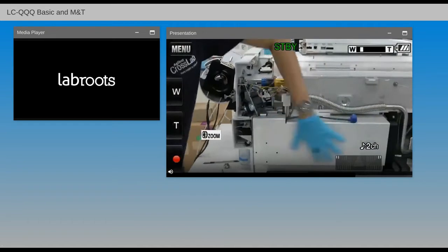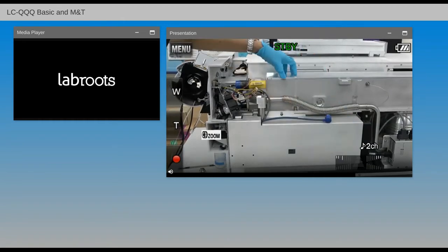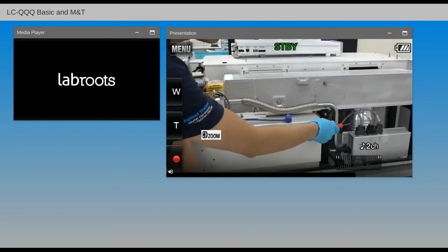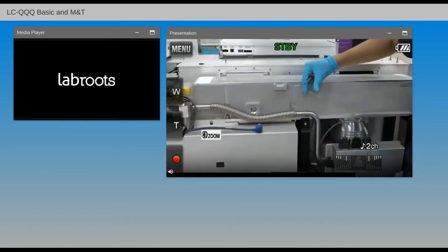What you do not see is of course the turbo pumps that are hidden in there. We do see the back end of the pump, the roughing pump, over here. And I shall go over. There is a brown tubing, and you may be wondering what this brown tubing is for.